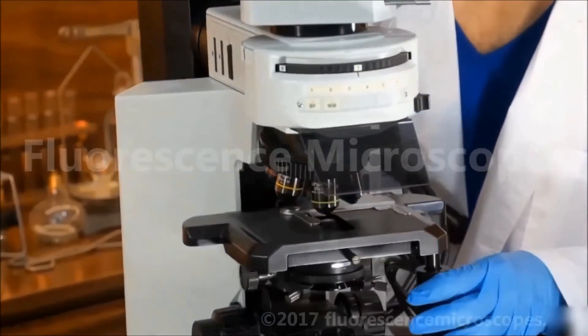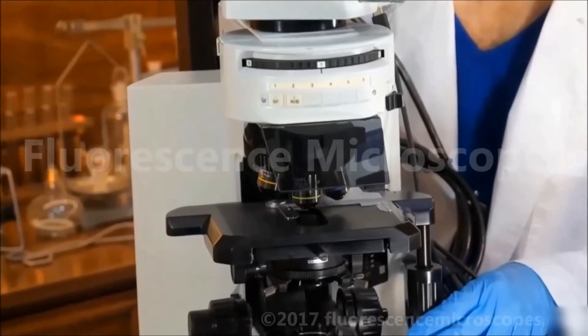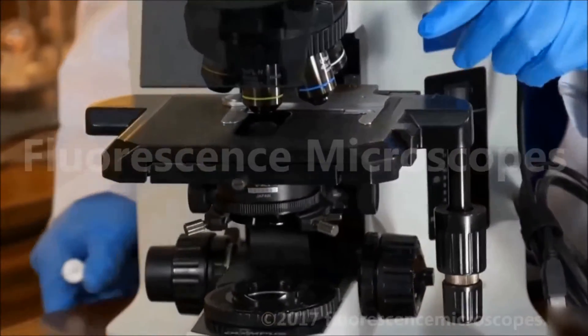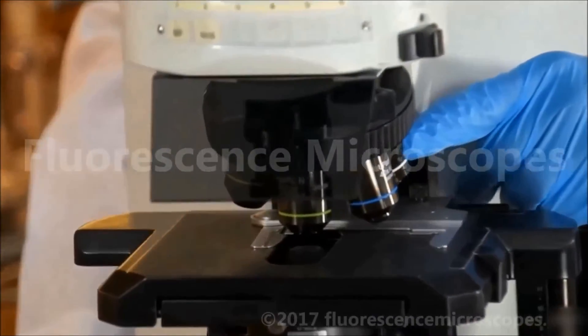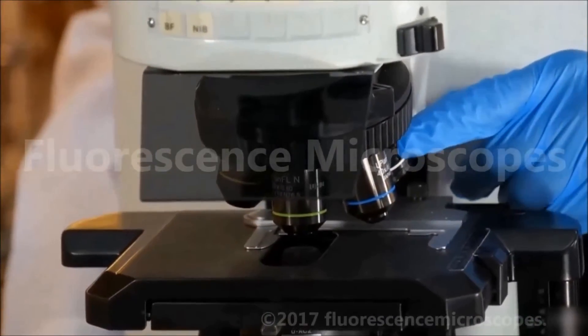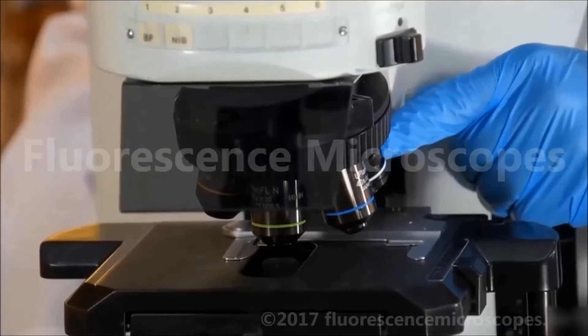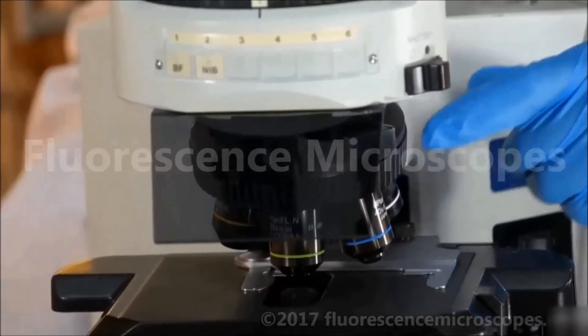We have a right hand XY stage. We also have a 100X with an iris. This iris is good for cutting out the extraneous light to blacken your field so that you're not getting too much light.